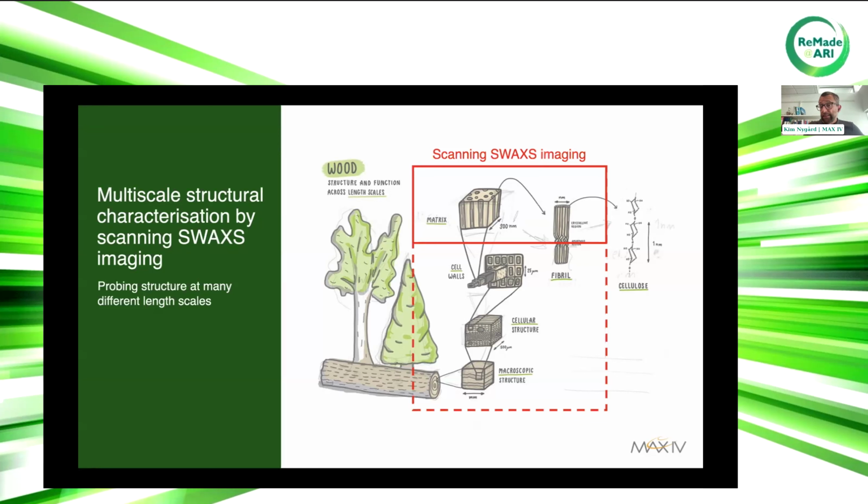Depending on your sample, we can map out from a nanometer up to 10 millimeters. That's these 7 orders of magnitude in length scales in a single experiment. Okay.